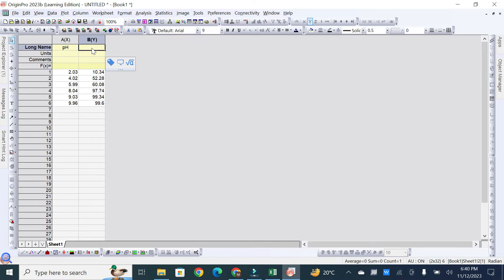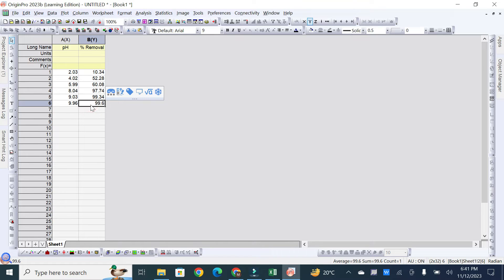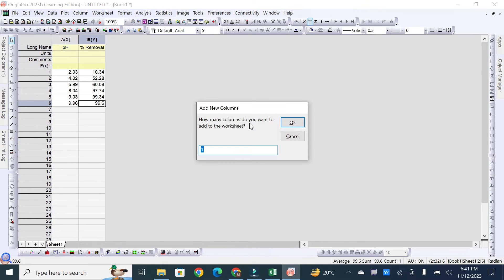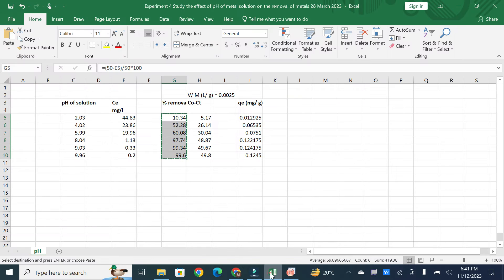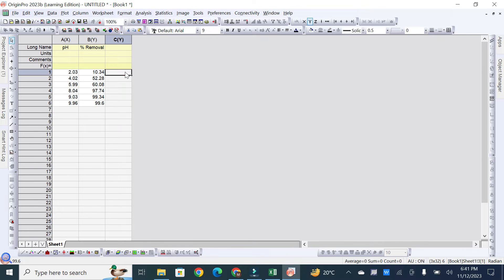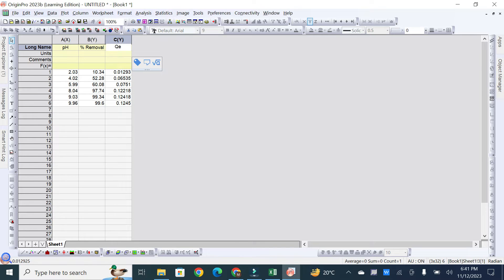Now if you see that you need one more column, to add a new column just click Ctrl+D and it will ask how many columns you want to add. Click OK to add one column, or enter the number manually for more. In the third column, I will add the QE data as the second Y-axis, rename it as QE, and the unit will be milligram per gram.